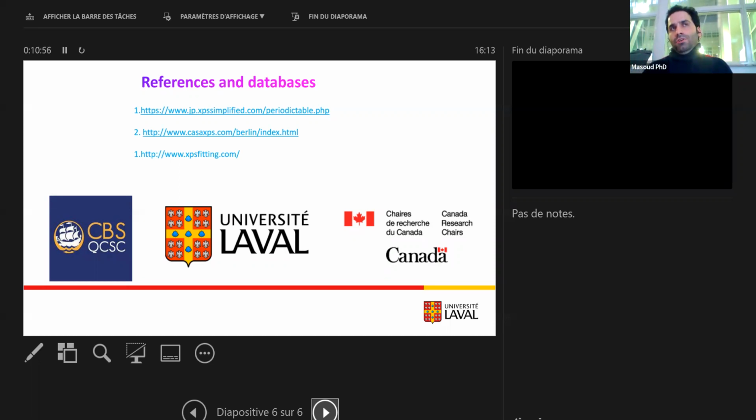So with this short introduction, I would like to go directly to the CASA software, and then we will start with how to work with the parameters, the options, toolbars, and all this stuff on the CASA software.